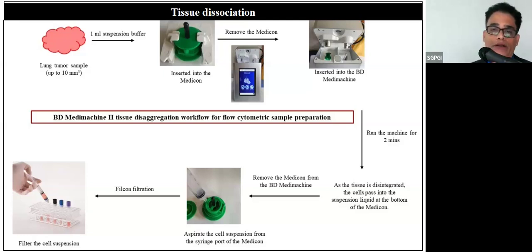For tissue, there are options available. In our hospital, we have a tissue dissociator from BD, a tissue homogenizer. You put the cut tissue in the given module, spin it, and it will release the WBCs that can be aspirated into the tubes. Those who do not have a tissue homogenizer can simply take a Petri dish, put in PBS, take a mesh, put the tissue on it and just tease it. Unfortunately, I do not have the photograph, it got corrupted.